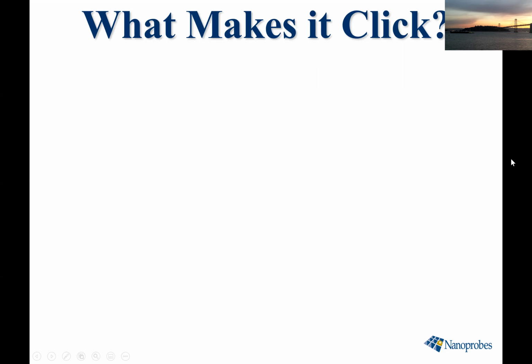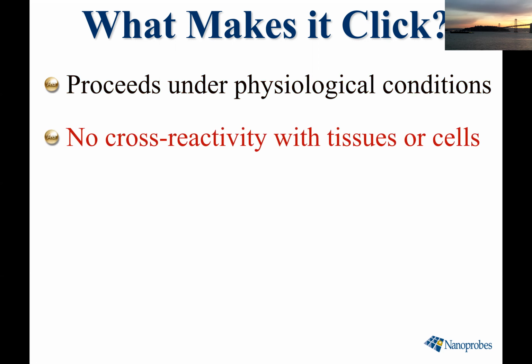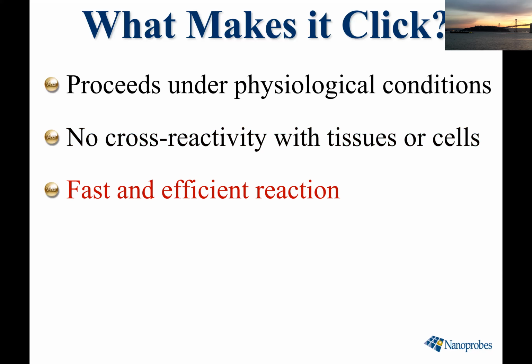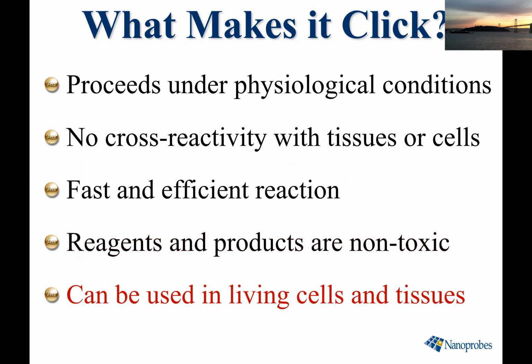What makes it click? Well, it's a reaction that proceeds under physiological conditions. There's no cross-reactivity with tissues or cells. It's a fast, efficient, high-yielding reaction. The reagents and the product are non-toxic and biocompatible. And that adds up to a reagent that can be used in living cells and tissues to image life processes.